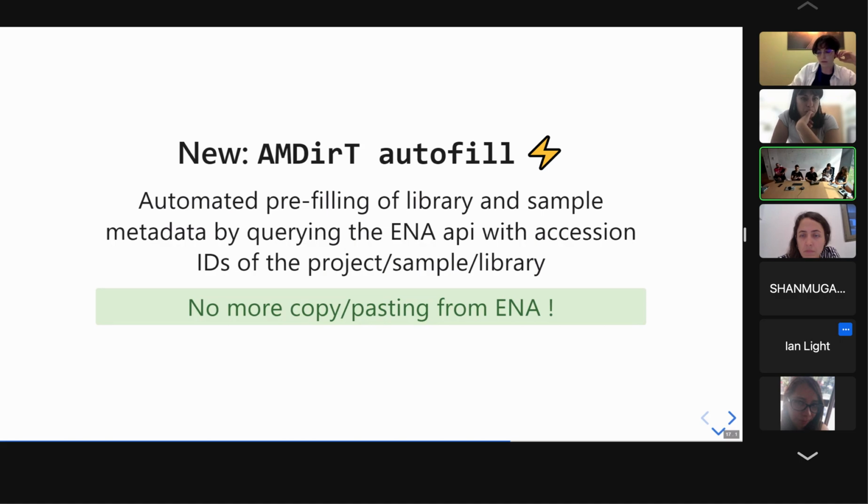Then you still have to enter manually the rest of the metadata that could not be retrieved from ENA, and check that the automatically filled metadata are correct, because it can happen that the authors themselves, when they uploaded their data to ENA, screwed up a bit. And then you can use the merge command to integrate it directly into the AncientMetagenomeDir master table.